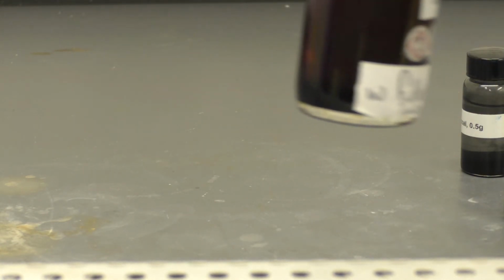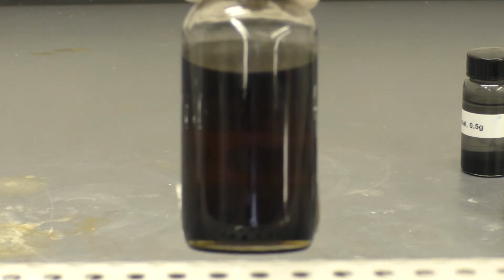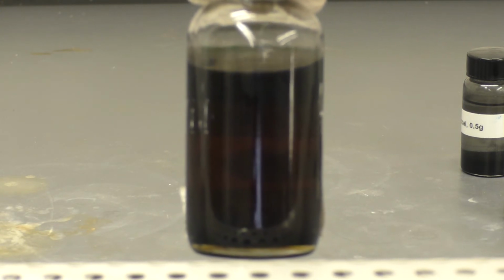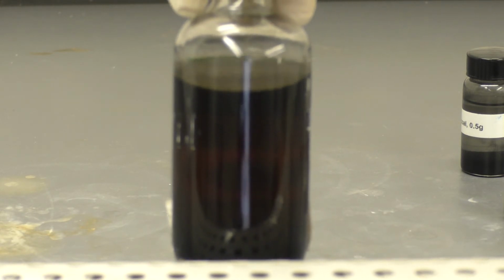we have some from previous extractions that we can take a look at. I think you can see there's a nice sort of wine color to this sort of a purplish red. And that is the indicative color of Buckyballs. So we had successfully extracted them out of the soot with toluene.